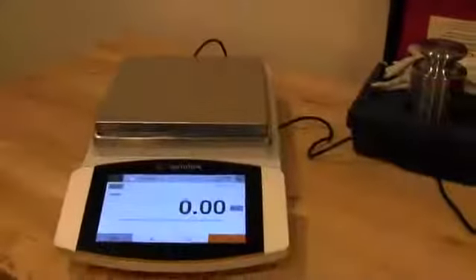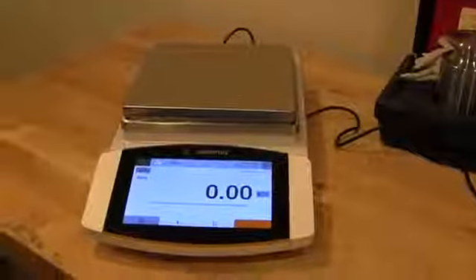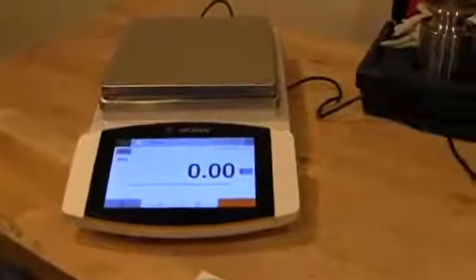Now once I'm in the weigh unit weigh mode, I can put on some weights and we can see how this balance performs.